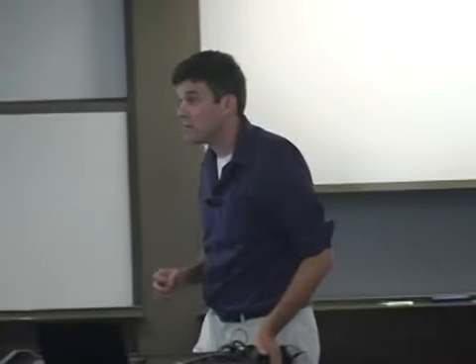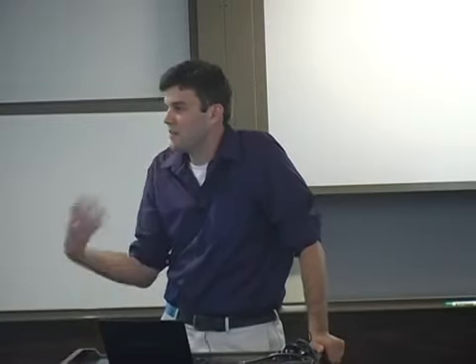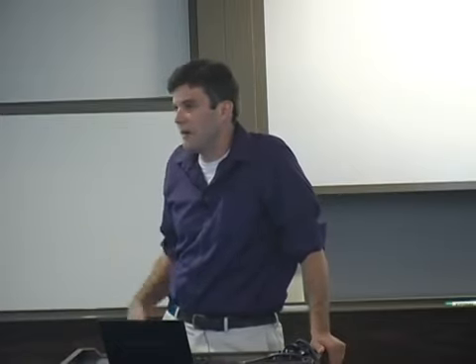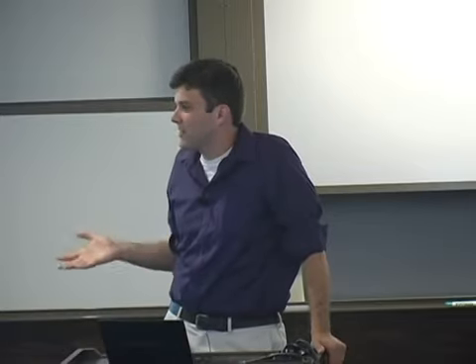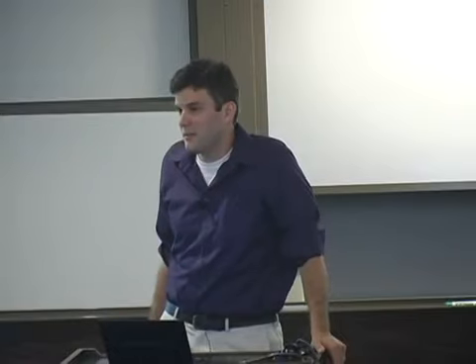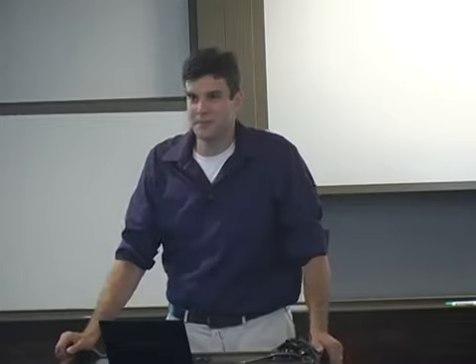Yeah. So do you have any kind of sample workflows up, especially for things like 2D NMR data? So the tutorial does. There is some sample data that you can play around with, but it doesn't go through a processing. I've been kind of meaning to do it, but the real problem is I'm trying to figure out where to put these big files, host them. So I have some ideas and I'm working on it.